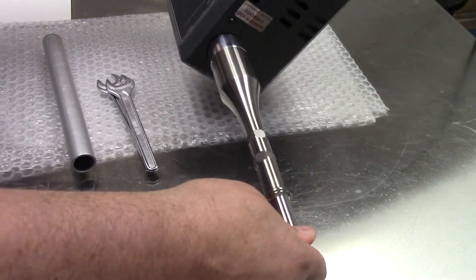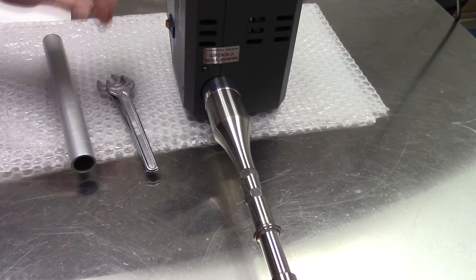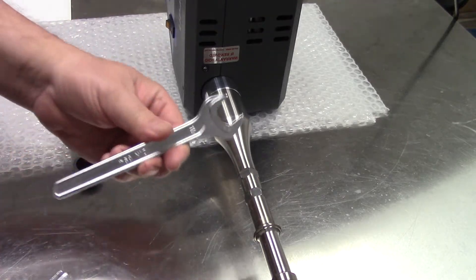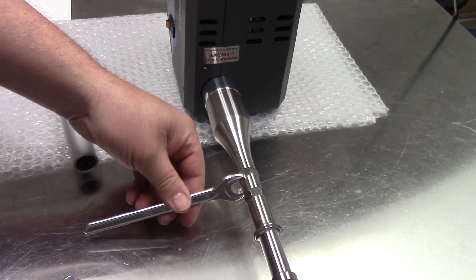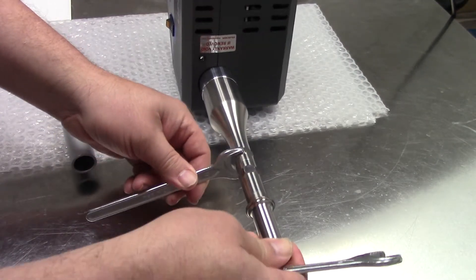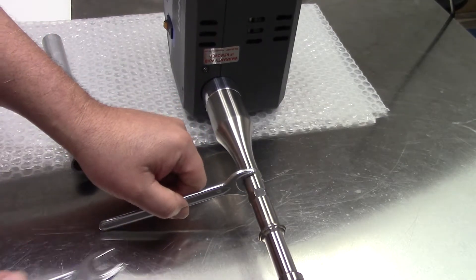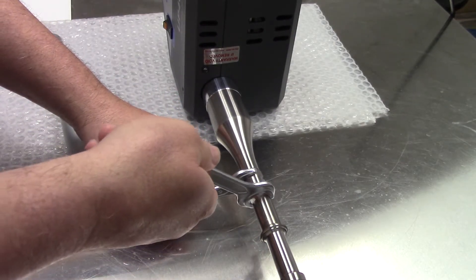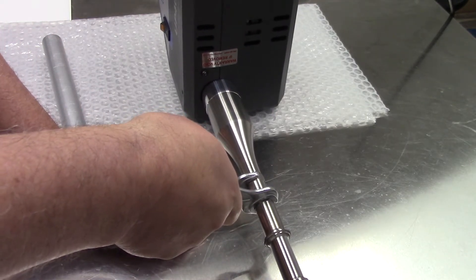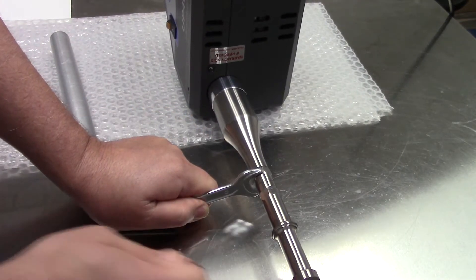Turning the unit on its side on a cushioned material so as not to scratch it, I'm going to position the first wrench with the C facing up and the tip touching the bottom. The second wrench will fit on, and I'll hold my hand and push down — and you'll hear it pop.